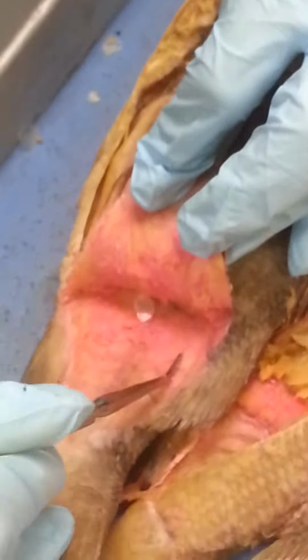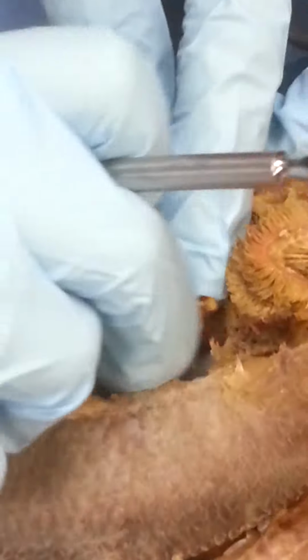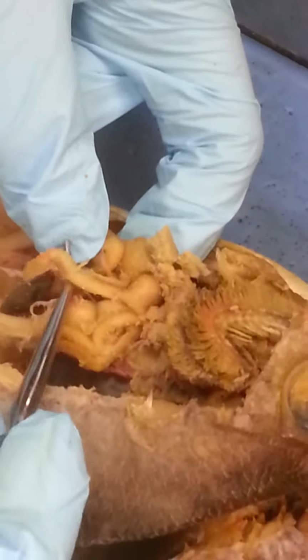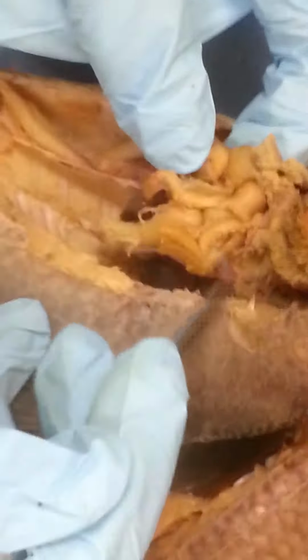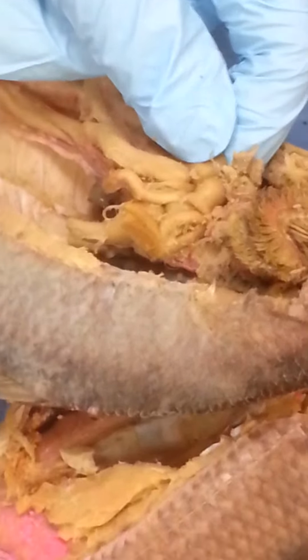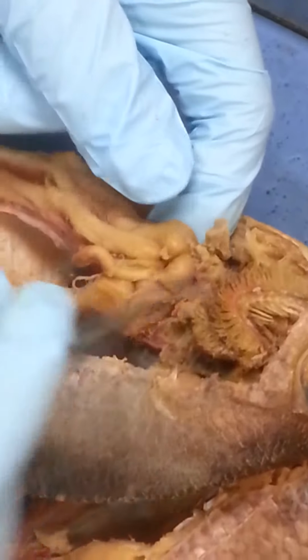All right. Let's go into the digestive system. Up here is more of your esophagus. You have your liver. This is your cardiac portion of the stomach, where it's not going anywhere. And then you have your pyloric portion, which is kind of this area here. You have those little pyloric ceca coming off, little blind pouches. Your pyloric sphincter is this kind of band region, and it's regulating what's going into the intestine, so it kind of is a progression over time, slowly.